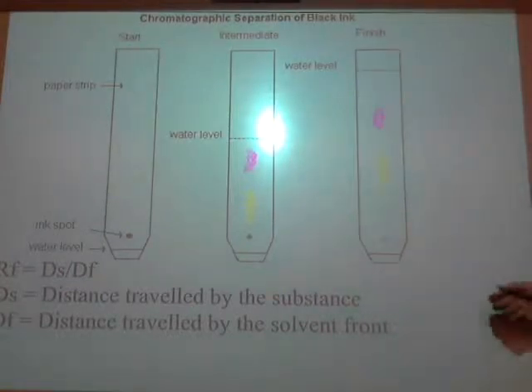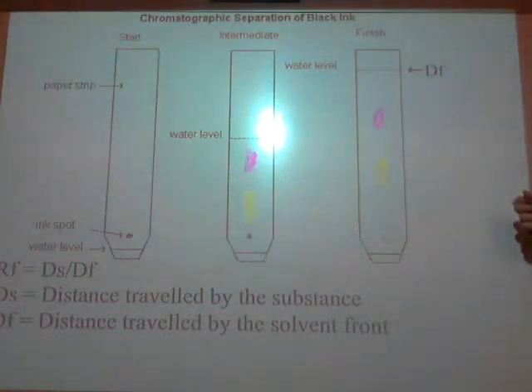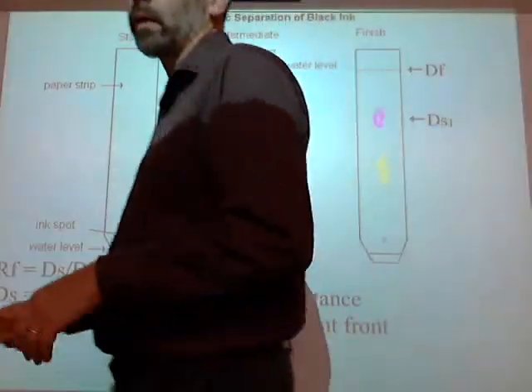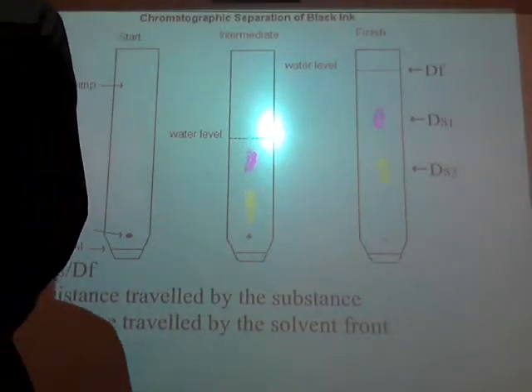Label these over here so you know. Df is this guy right here. That's how far the water travels. You should have it. Oh, you weren't here yesterday. I'll give it to you. Ds 1 and Ds 2. Here you go.